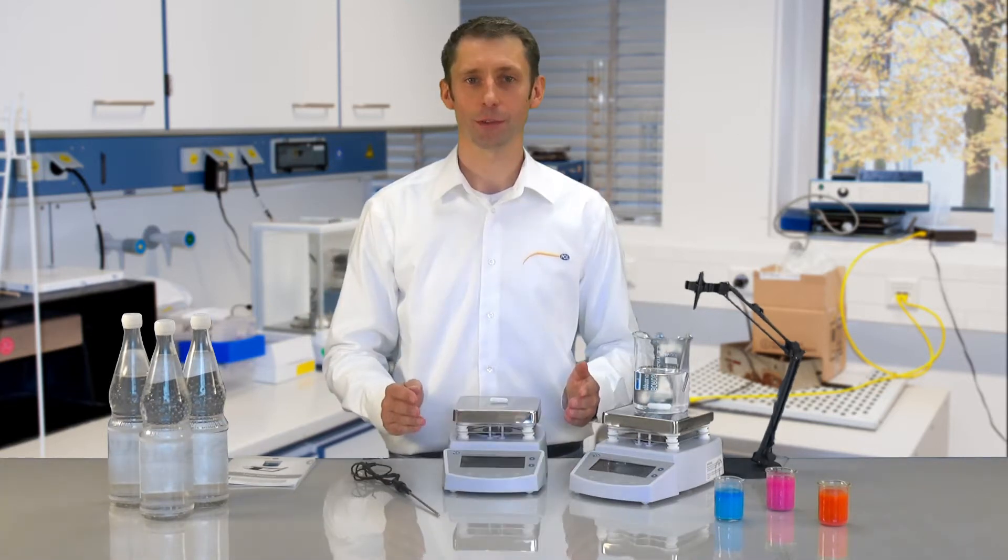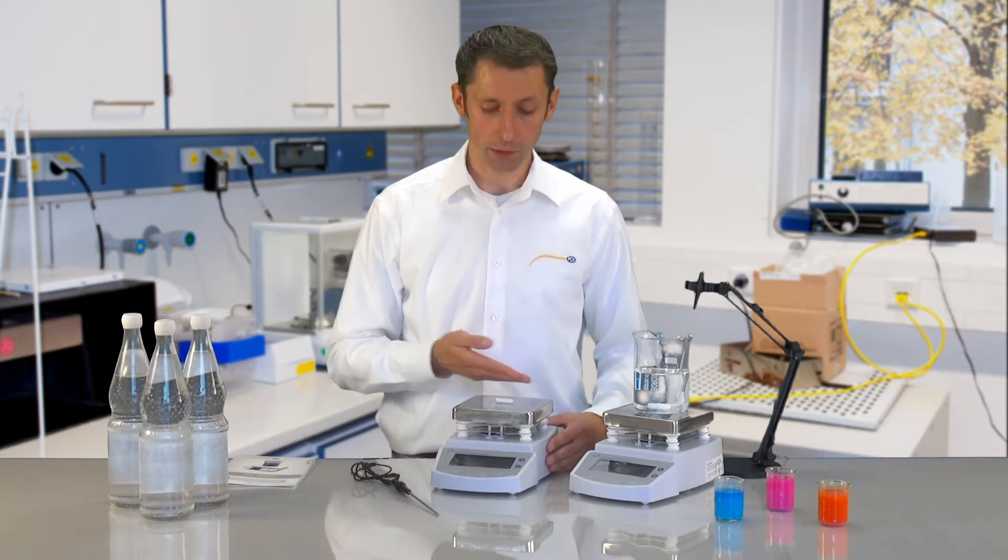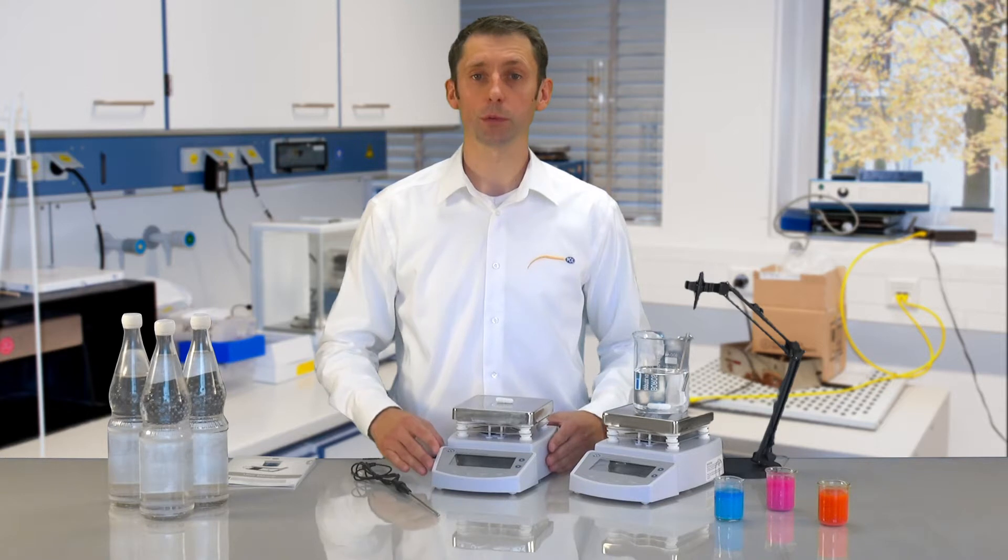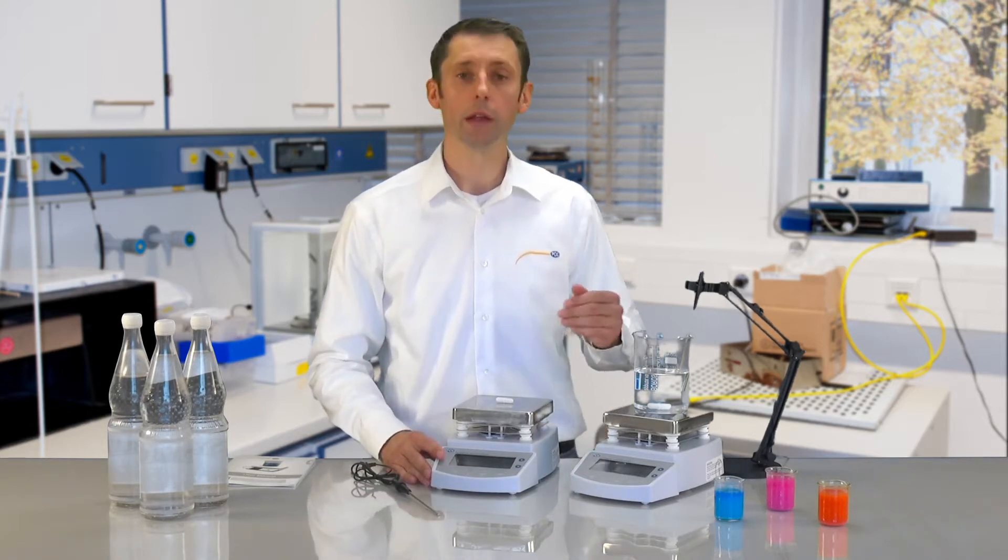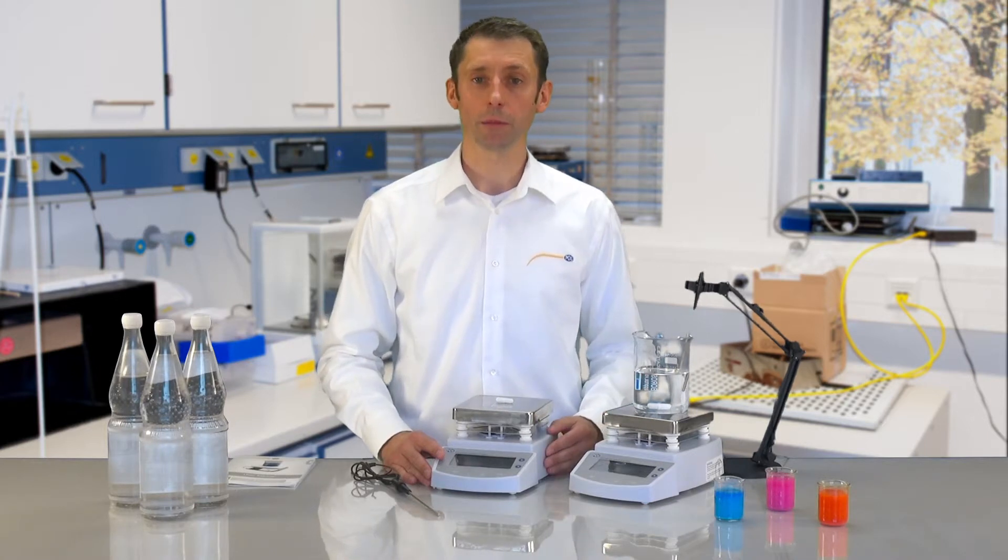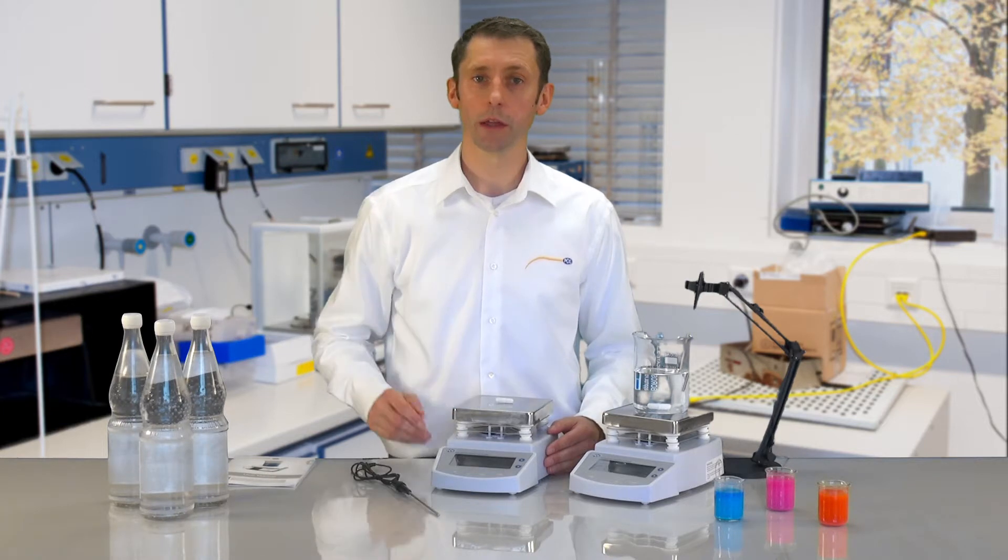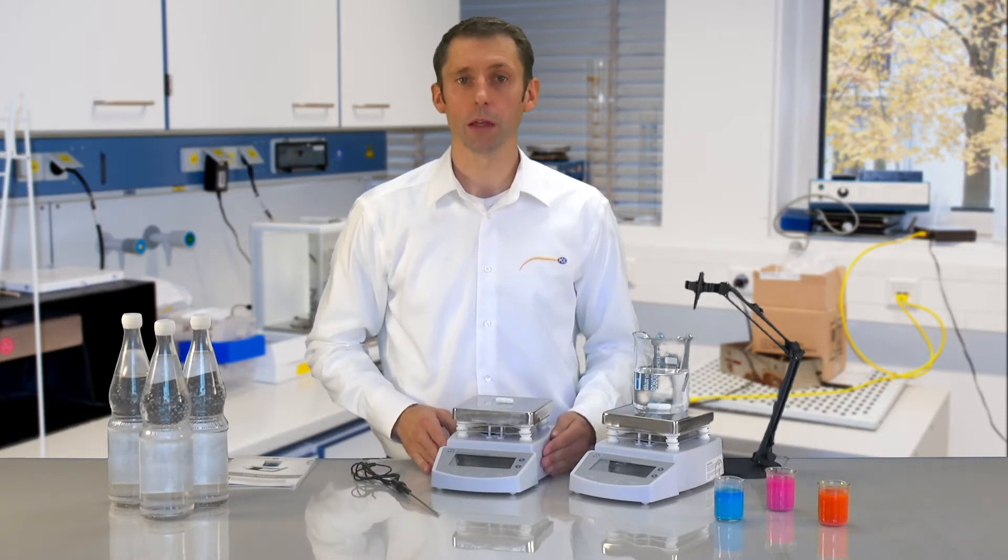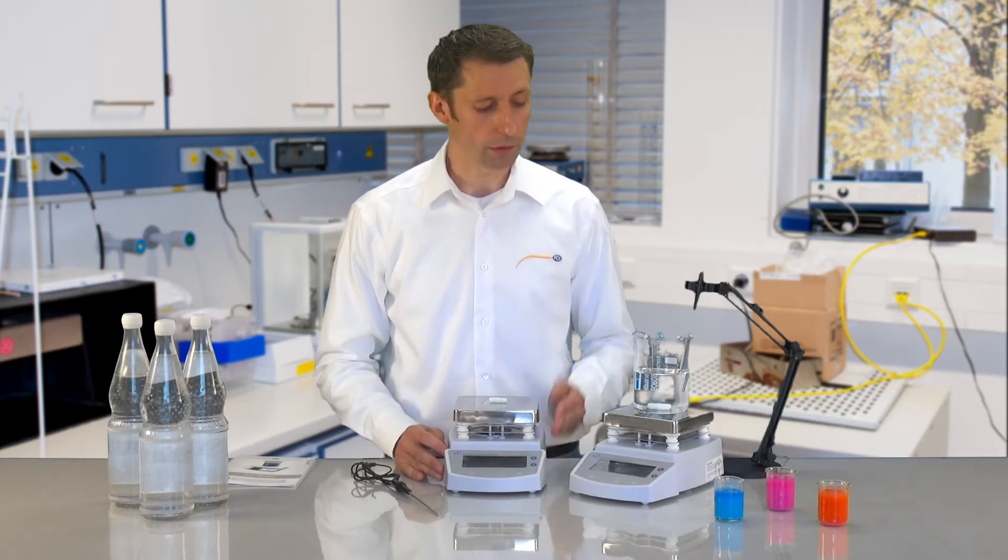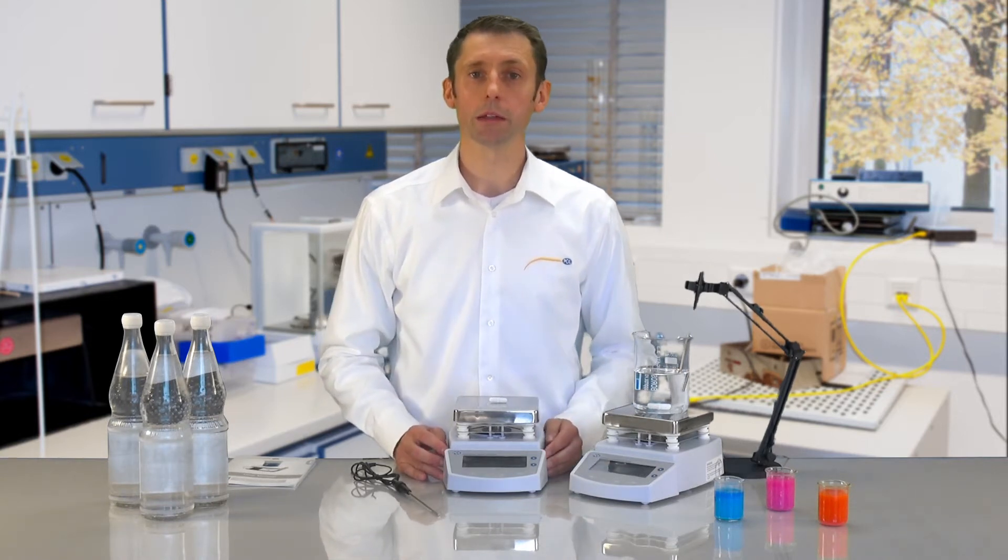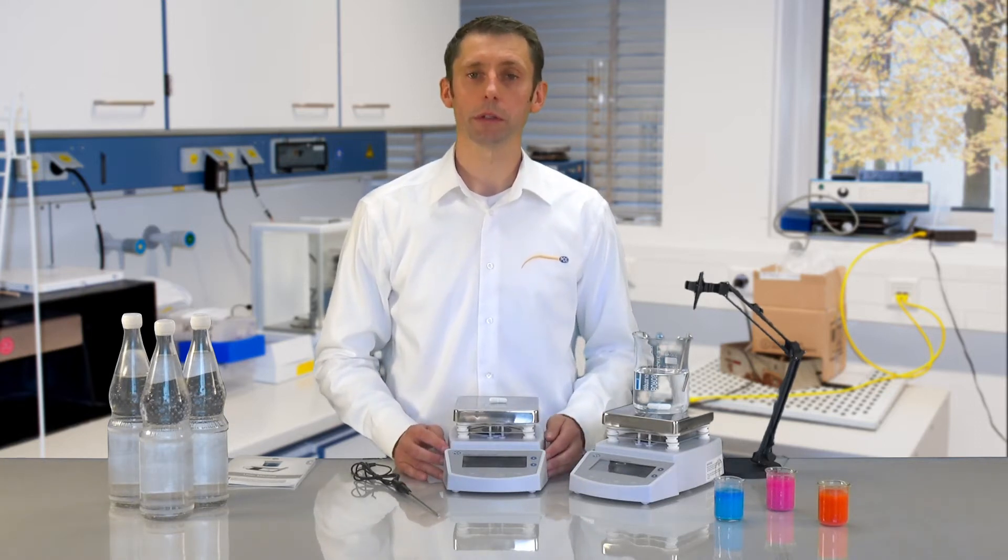I will now summarize shortly. The Magnetic Stirrer PC MSR 300 has a stainless steel surface with measurements of 125mm by 125mm. The stirring volume is 2 liters, which is the amount of water in these bottles. The stirring speed I can set in 35 steps up to 1250 revolutions a minute. The integrated heating plate can warm the probes up to 300 degrees, and the heating power is 300 watts.